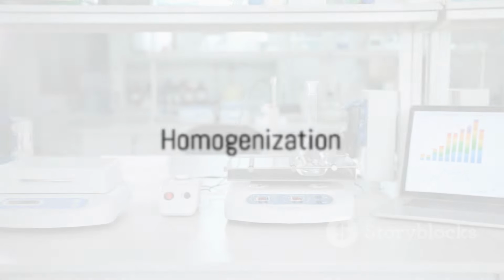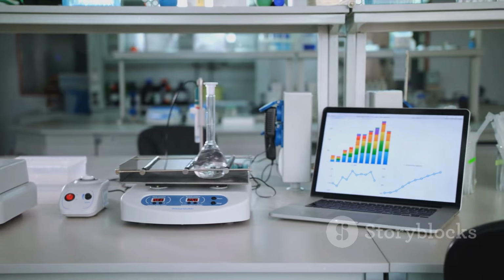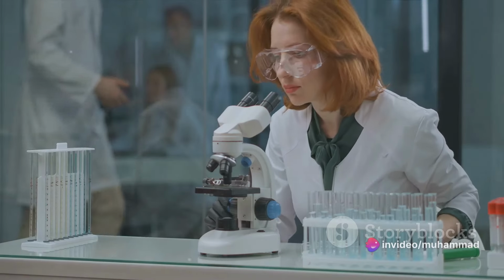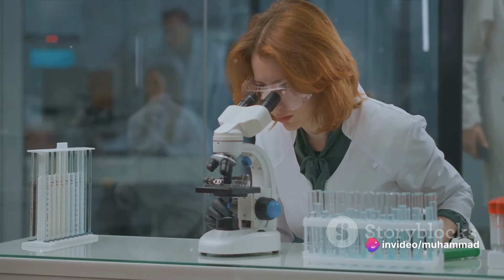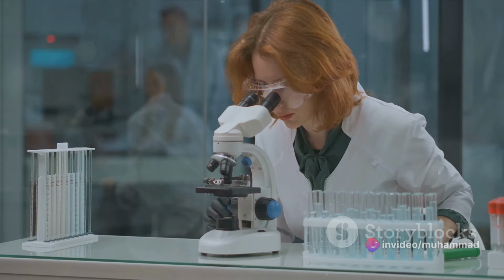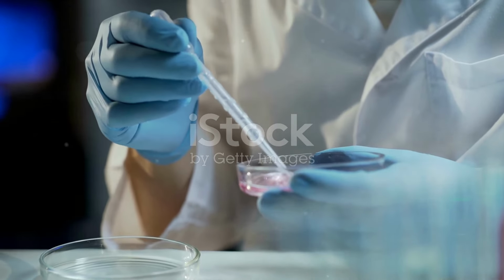To begin with, cell fractionation is a technique used to separate cellular components while preserving individual functions of each component. This technique gives scientists a chance to study and understand the inner workings of cells, paving the way for many medical and scientific breakthroughs. The process starts with homogenization.